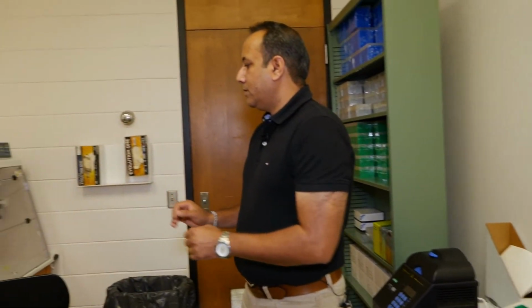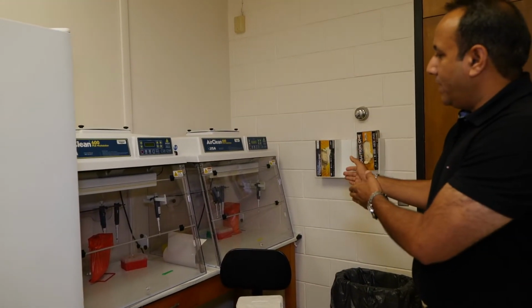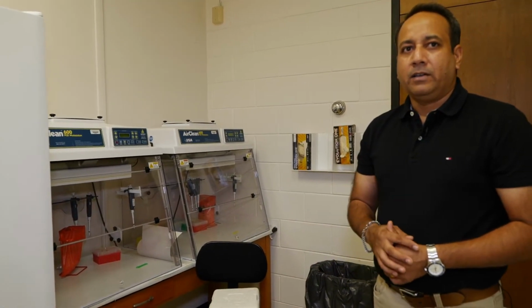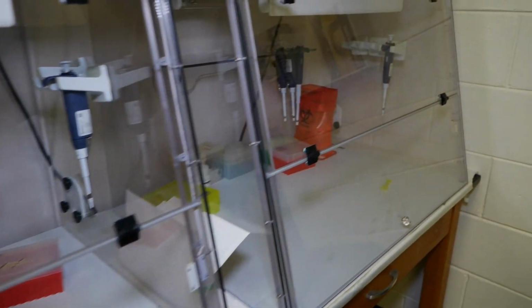These 2 workstations are our clean workstations. We use them to mix our reagents. One is for making the master mix, and the second one is for adding the DNA template that we isolated from the plants, from the leaves of the plants, plant tissue.